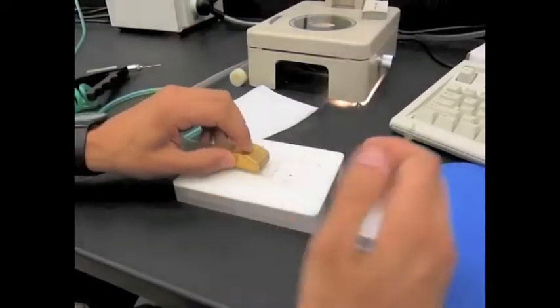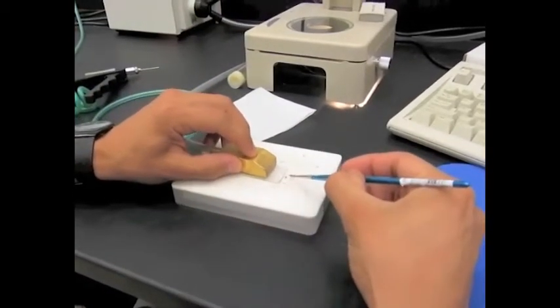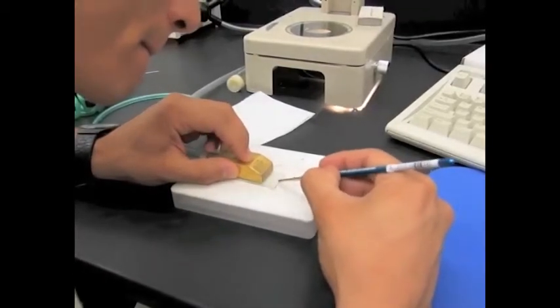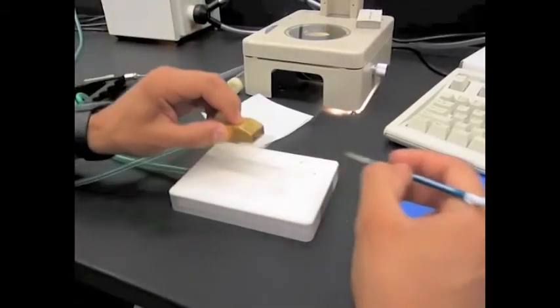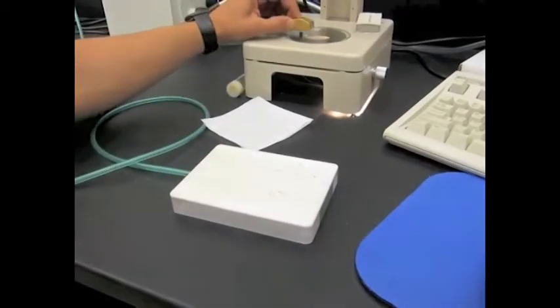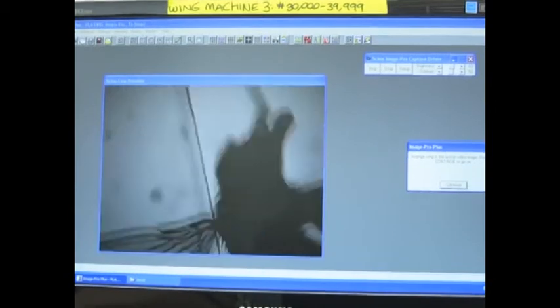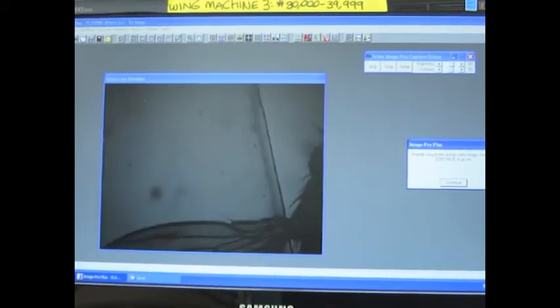Using the paint brush, gently roll the fly toward the Wing Machine until the wing is sucked in and place it on the microscope. You can now adjust the position of the fly until your wing is in full view and make sure that it is a good image.